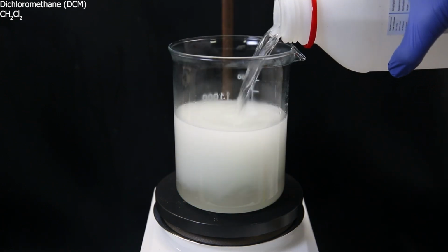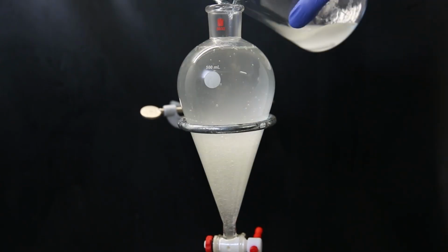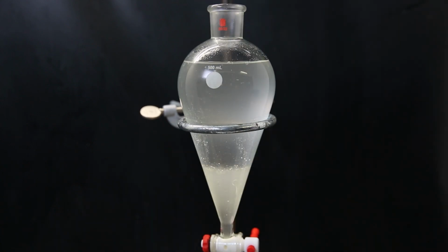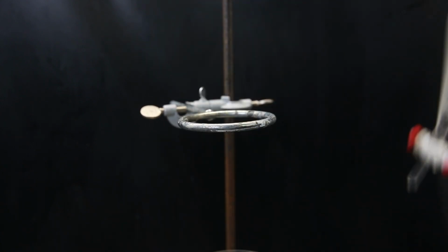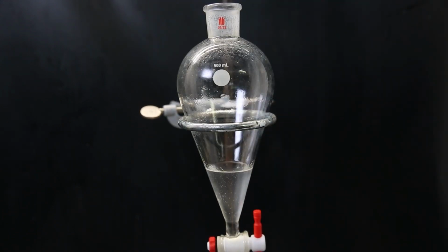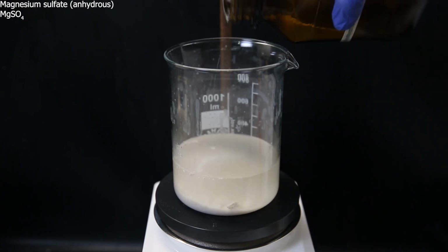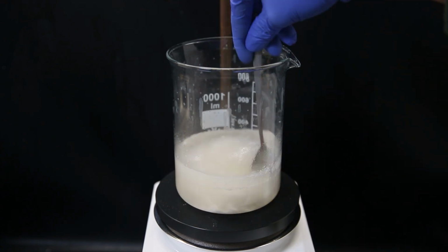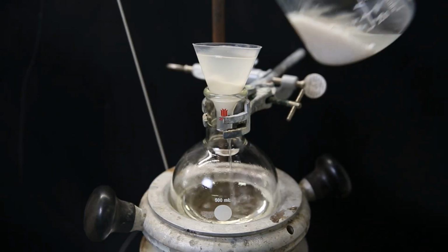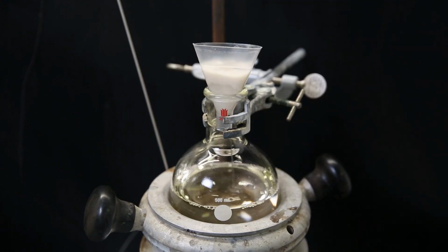Then to dissolve all of the acid, I add a bunch of DCM. I then move it all to a separatory funnel and take the lower DCM layer. I then extract the remaining water layer several times with some more DCM. I combined all of the DCM extracts in a beaker and add some anhydrous magnesium sulfate to absorb remaining water. The solution becomes transparent, and I then filter it all through some cotton to remove the magnesium sulfate. I wash the beaker and filter a few times with DCM to make sure it's all washed down.